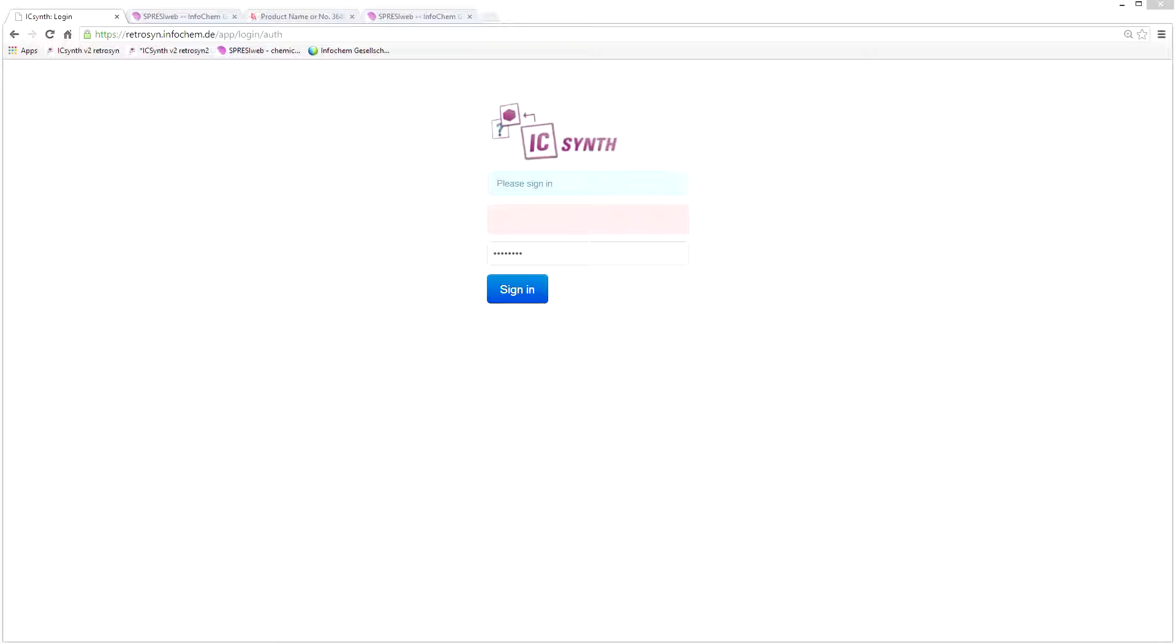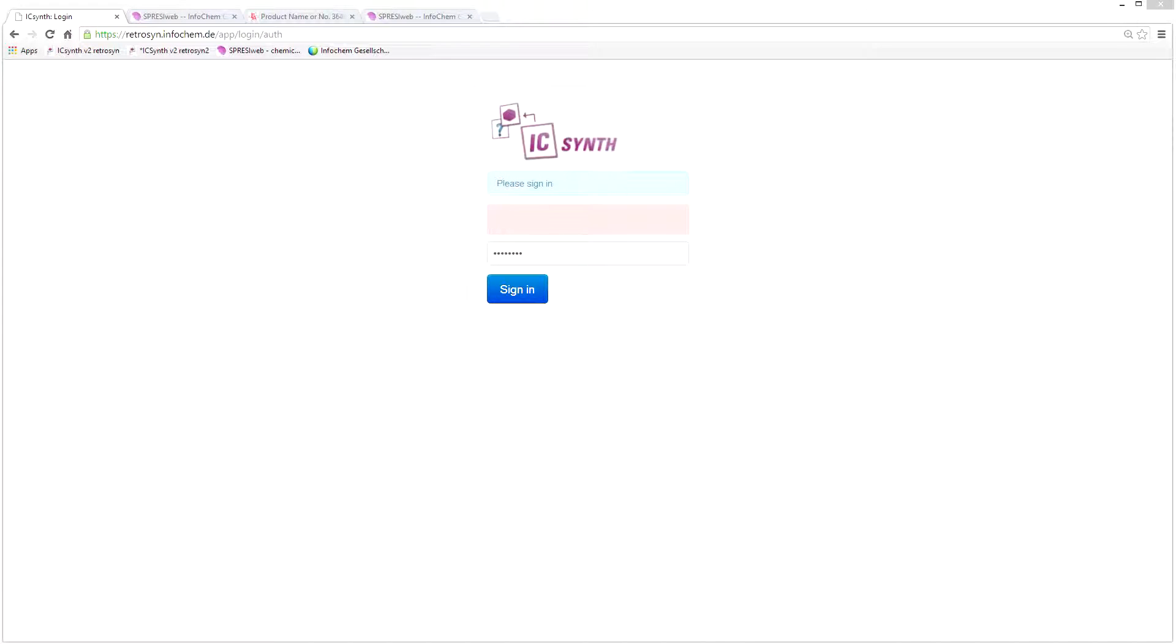ICSynth can be accessed via web browsers and Google Chrome is recommended. All user interactions take place in the web browser and the business logic of the system is installed on a secure server.